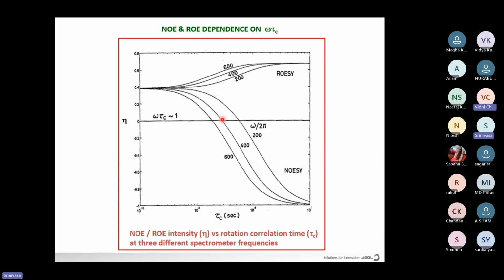If the molecular weight falls somewhere here, a situation like this may be the reason. When you are comparing data, you should compare 500 to 500. If you're not getting it at 500, you will not get the same thing in the other instrument either.